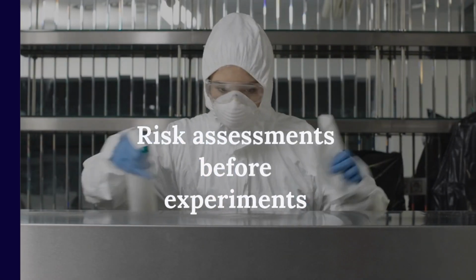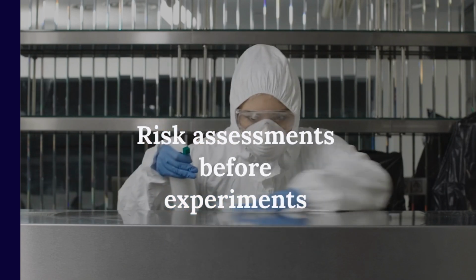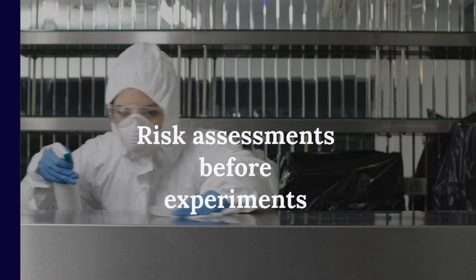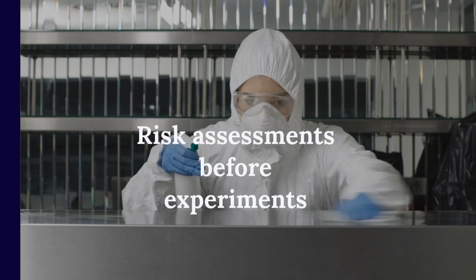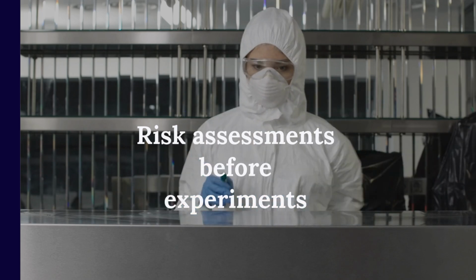Complete risk assessments before conducting experiments. Handle acids and chemicals with care. Use personal protective equipment as instructed. Dispose of chemicals safely and correctly. Report any incidents immediately to maintain safety.